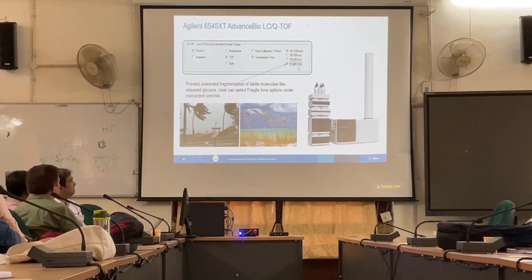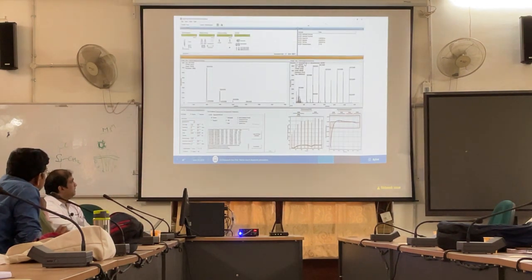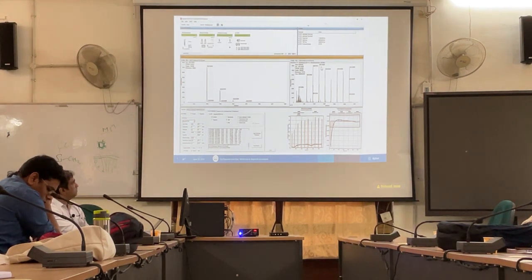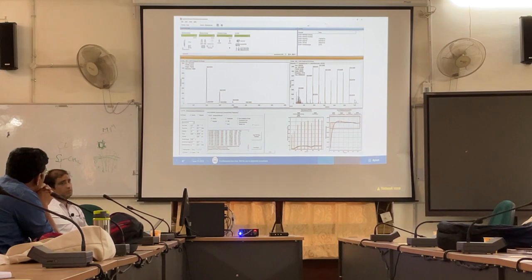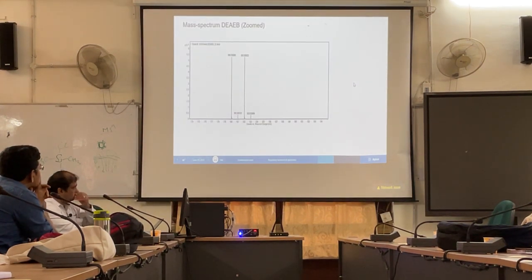Okay. Then we have another tune called fragile ion tune. Fragile ion tune is a tailor-made tune for metabolomics. I will not go into it; we'll demonstrate it in the lab, that will be better. This is how the tuning page looks. You have these 7 masses, as Amol was mentioning: 322, 622, 922, 1221, 1521, 2421, and 2721 is our highest mass. You can see all of them here, and we will establish the relationship. We'll do this tuning in the lab, nothing to worry about.